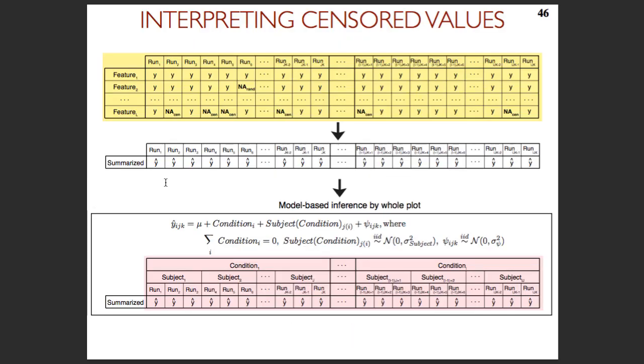Now that we have one number per protein per run, it becomes a much simpler problem, because now we only need to worry about the biology and things such as group comparison, repeated measurements, technical replicates, no technical replicates, and so on. This is much simpler because we already produced all the summarization. For this type of model, there is a lot of infrastructure in R. This type of model has existed for a long time, and we can now fit the model which matches the design. Any questions?